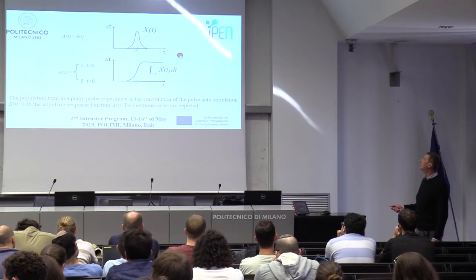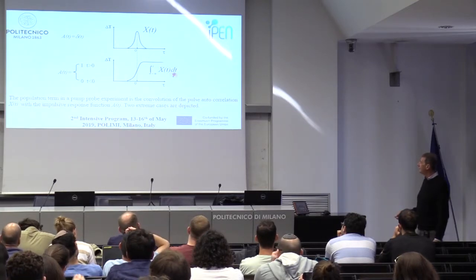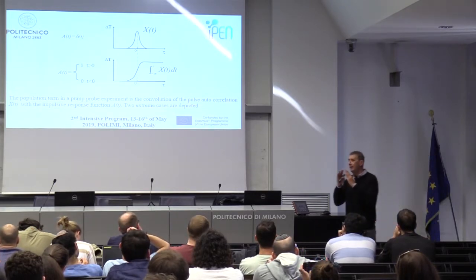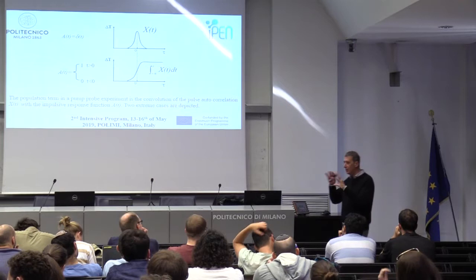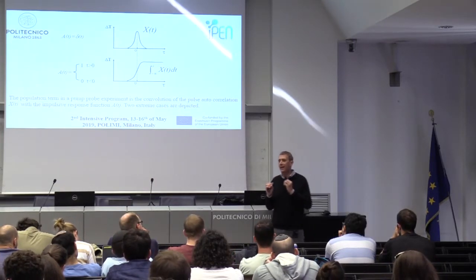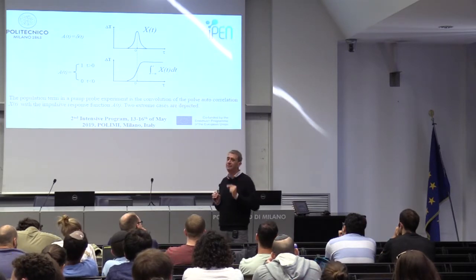Sometimes you are, of course, in between. So you have a rise time, and then you have a fast decay, and then you have to be careful. If you get a symmetric shape, well, it means you're not really measuring anything. Then there are people that still go inside the shape and, knowing the pulse correlation, extract information. But personally, I do not believe people that report time constants which are shorter than the pulse.